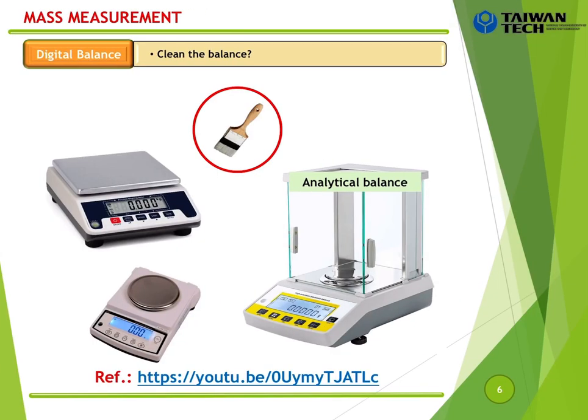Okay, and the next one, after using, you should clean the balance, because if you don't clean the balance, it will be really dirty, and it may affect the results of other people. So if you use the balance and it's really clean, and it's okay, you don't need to do anything.